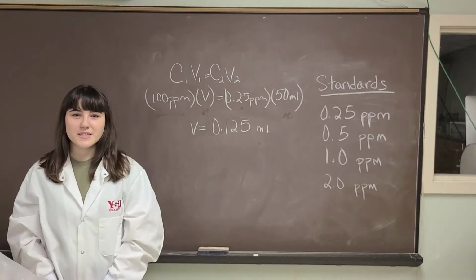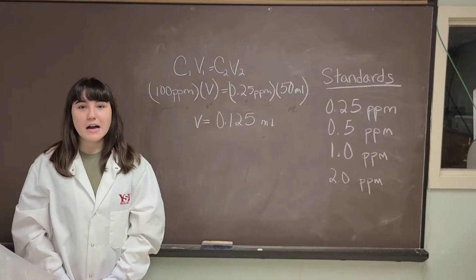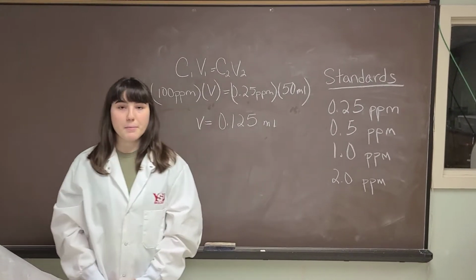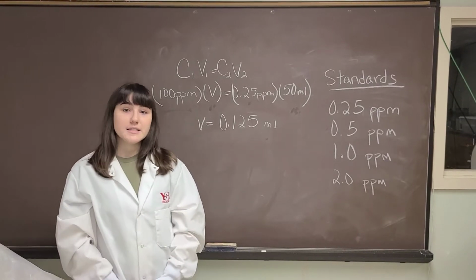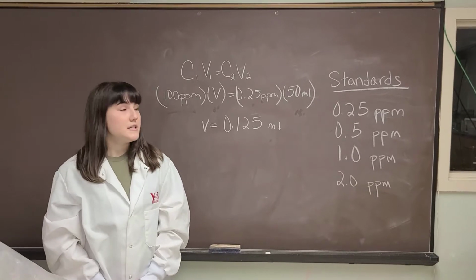I'm a Master's of Science in Biology student, and today I'm going to be going over ICP analysis. So we already did the ICP preparation and the digestion, so our samples are ready for the ICP analysis, but we do need to make standards.